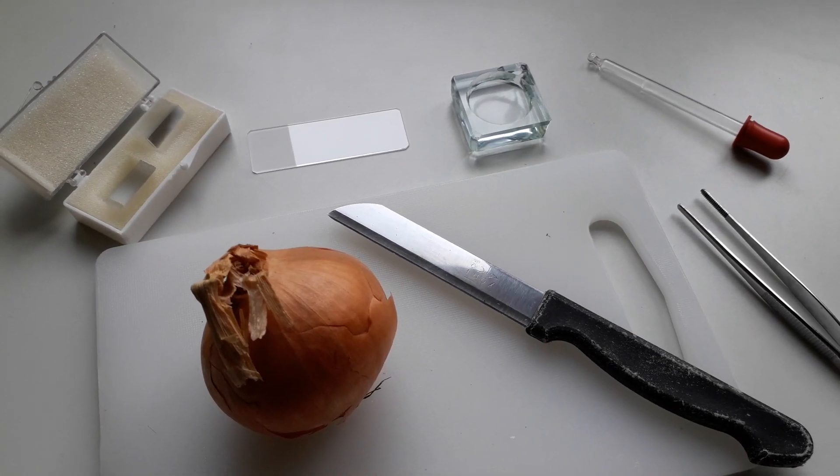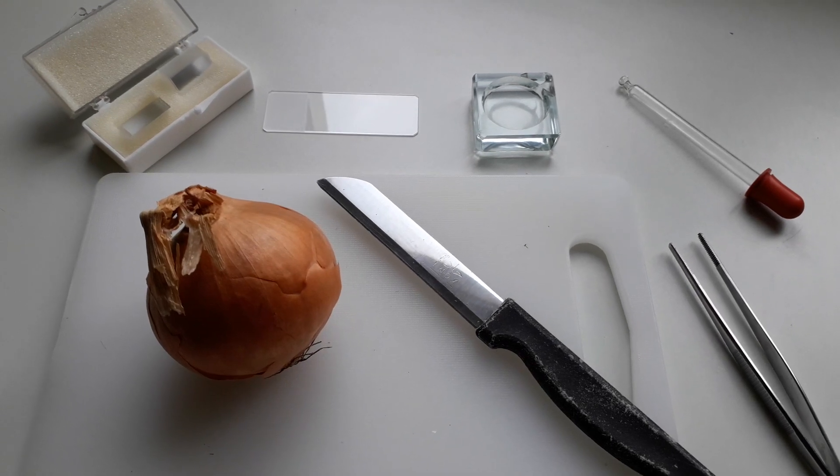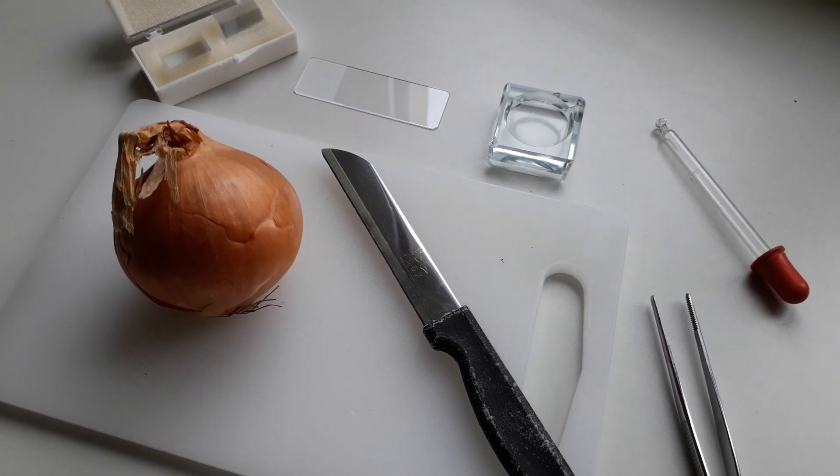Hi, hello and welcome. MicrobeHunter here and today we're going to look at the cell organelles of this onion. I'll have to first dissect it and then I'll put it under the microscope.